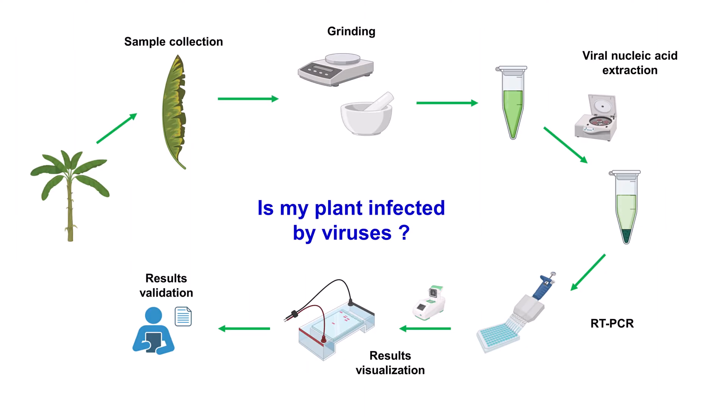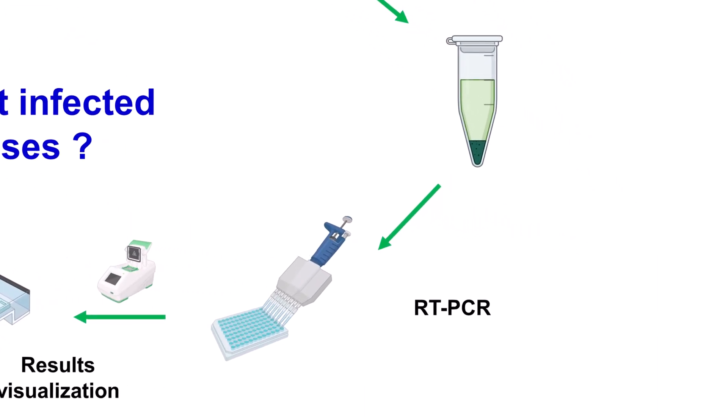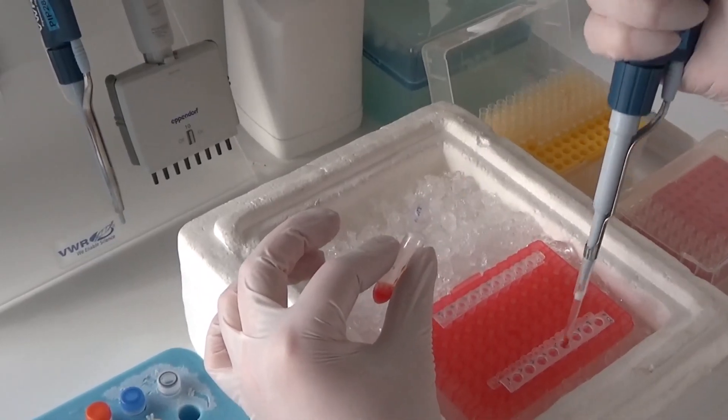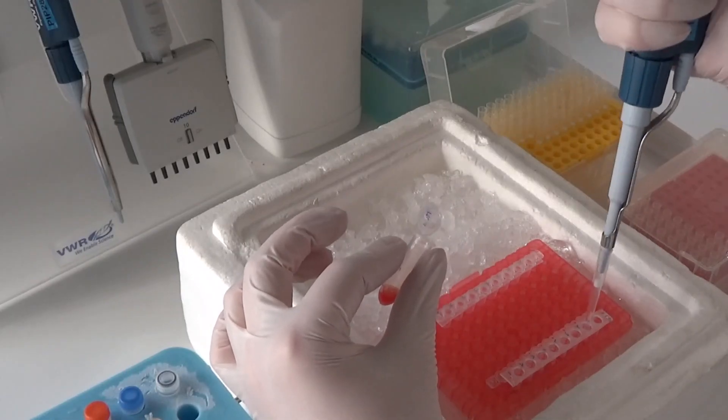The RNA extracted will then be used for RT-PCR tests in order to detect the viruses of interest. Under the dedicated hood previously treated with UV for disinfection and DNA elimination, cDNA will be synthesized and then amplified with specific primers for each virus targeted in simple or multiplex reactions.